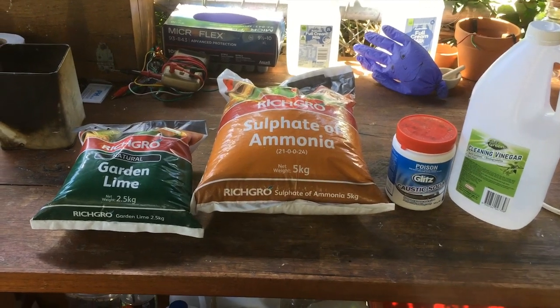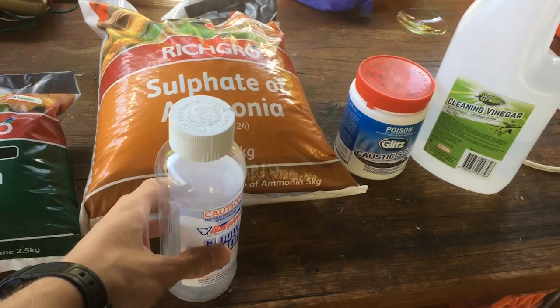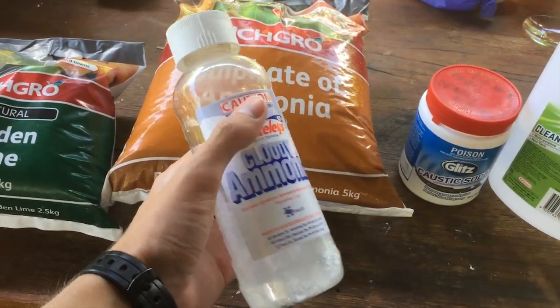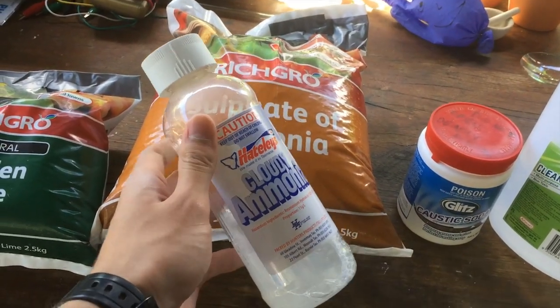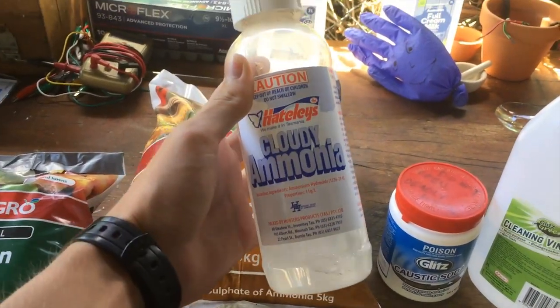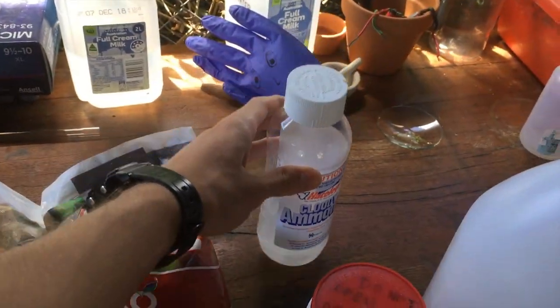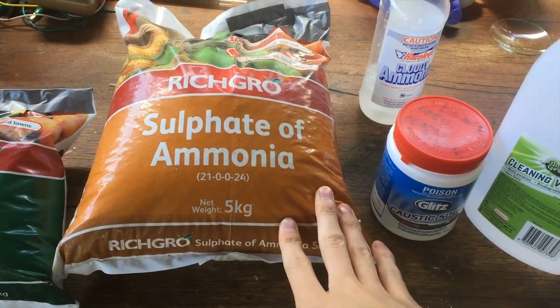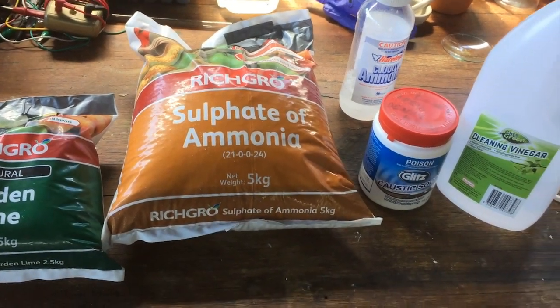For a video in the near future I need some ammonia for the purpose of isolating nitrogen gas, and the ammonia that you can get where I live is not very concentrated at all. I've had a look in all the hardware stores, supermarkets and stuff, and the best you can get is around 1-2% — this is just 1% ammonia and it's very impure. It's got soaps in it, so I bought some ammonium sulphate fertiliser and I thought we'd have a go at extracting ammonia from the ammonium sulphate.